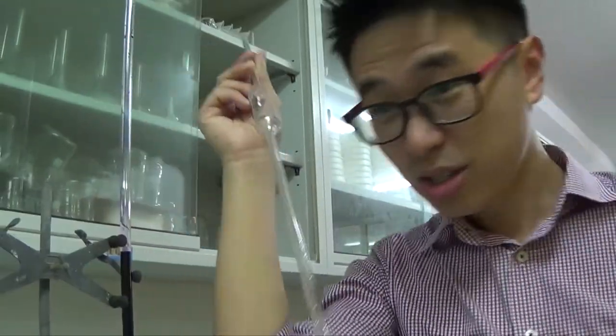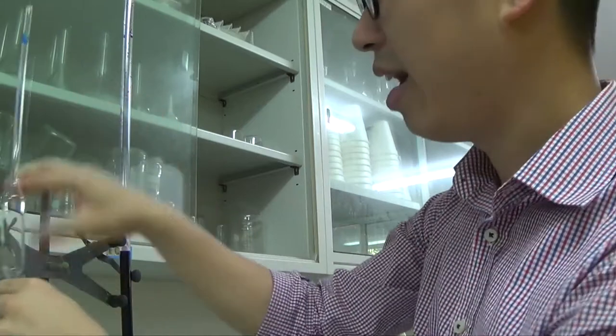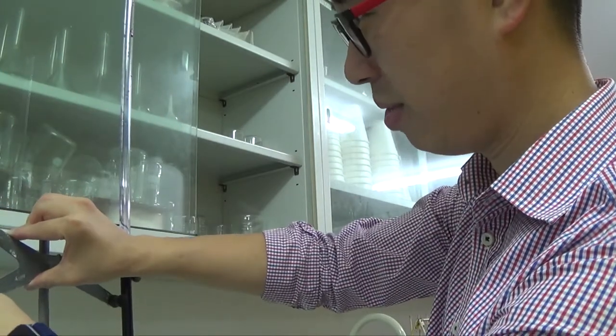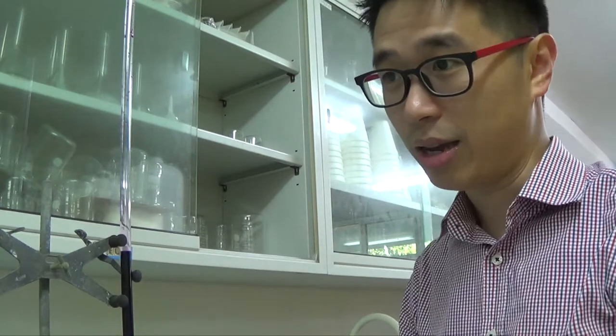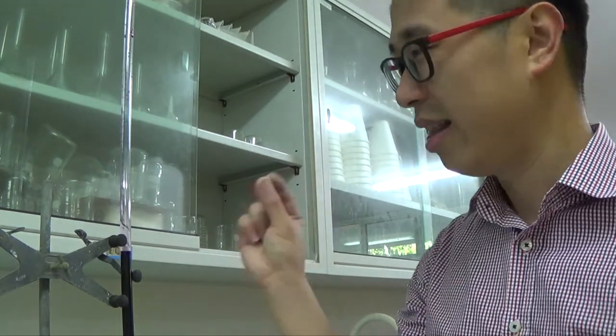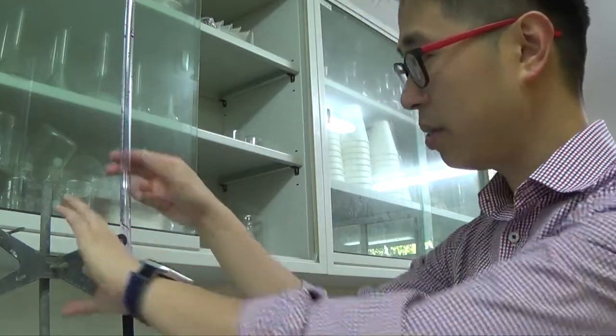1, 2, 3, 4, 5, 6, 7, 8, 9, 10. Not being superstitious, but some people are a bit pedantic to tap it up to 10. Some people tap a couple of times, all right. Like I said, the pipette accuracy already takes into account the last bit of drop that's left in the pipette.